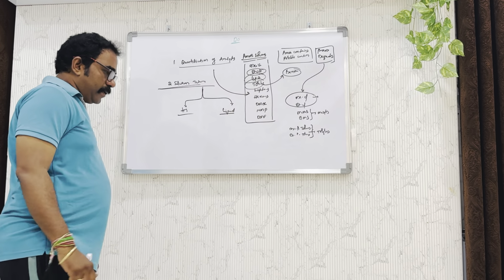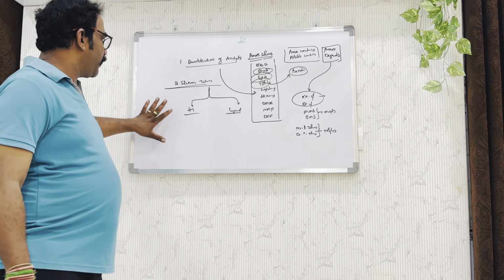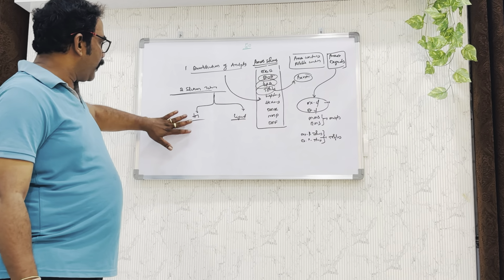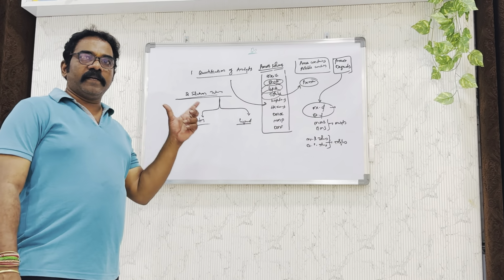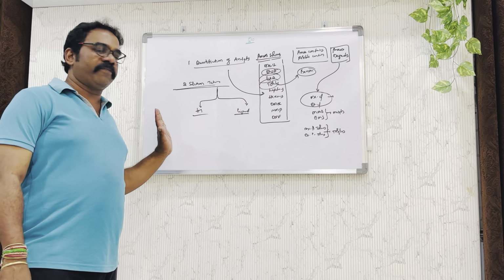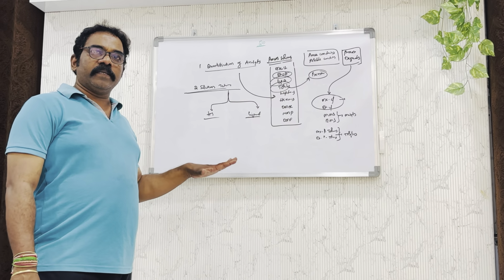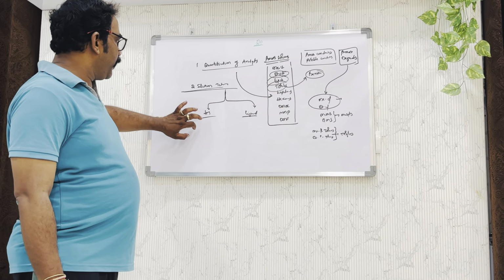In headspace, simply we take the drug substance, transfer it into a headspace vial, add 1 ml or 5 ml of suitable solvent, then incubate; the vapor goes to the GC column through the transfer line. This is a simple technique.